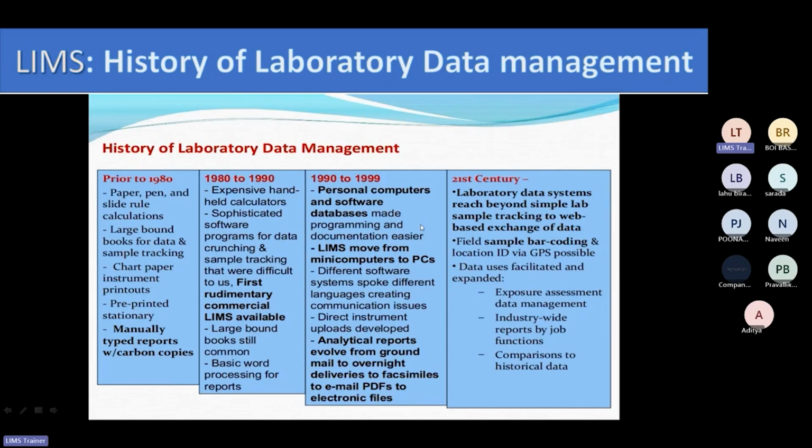But as time went on, and as inventions and new possibilities grew, some information management became available to the laboratory. They started using calculators and instruments that helped the analyst or end user improve the process and reduce the work time.